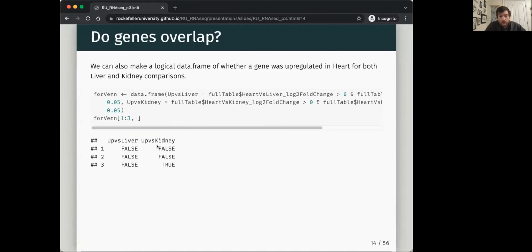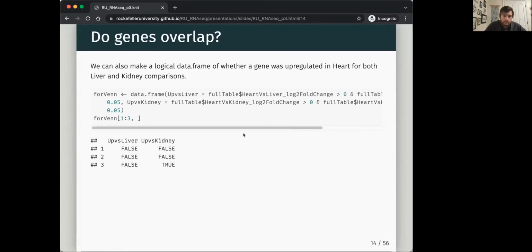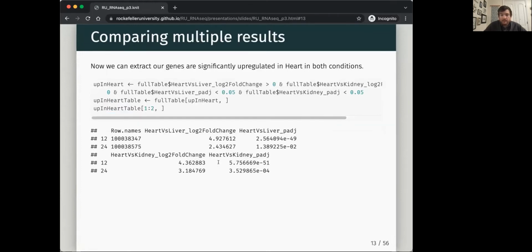And so in this question, we're basically asking the same as this. So this is how you create the subset. Let me re-summarize.